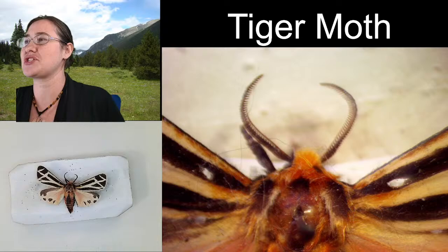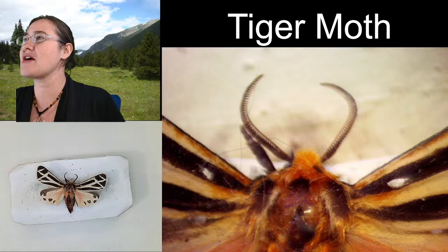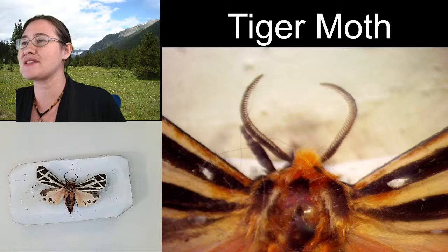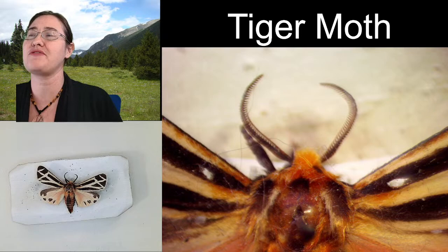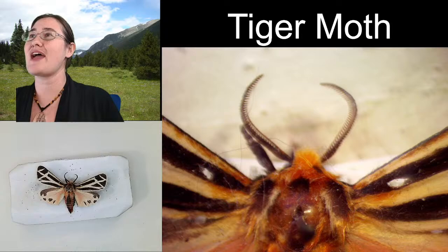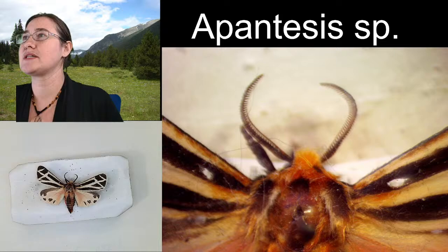I'm not sure the exact species on this moth, although I can get you to genus. It's definitely in the genus Apantesis, but there are a couple of different species that have varying spots or varying designs on their hind wings. And I'm not exactly sure what the character is that divides them. So, if I had to take a guess, I would say that this is the harnessed tiger moth, Apantesis phalerata. But I can definitely say for certain that it is in the genus Apantesis. I'm not sure exactly what species.